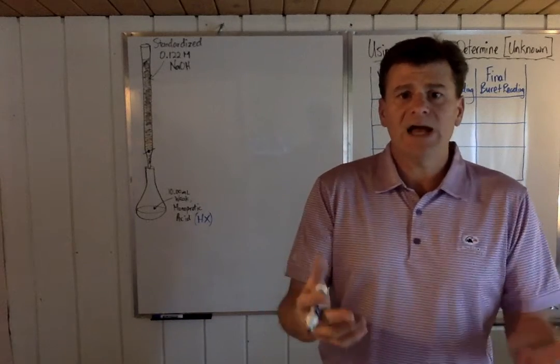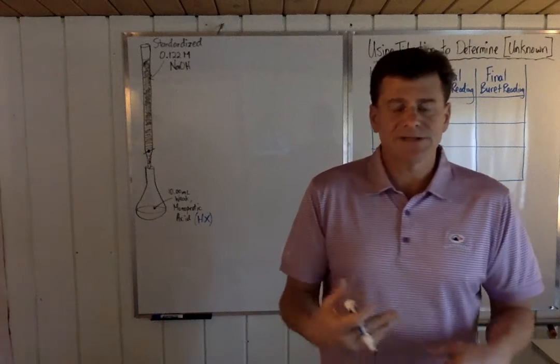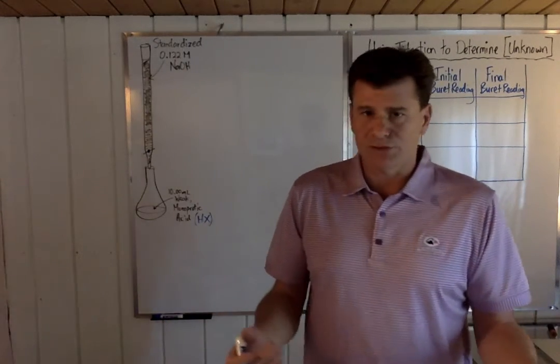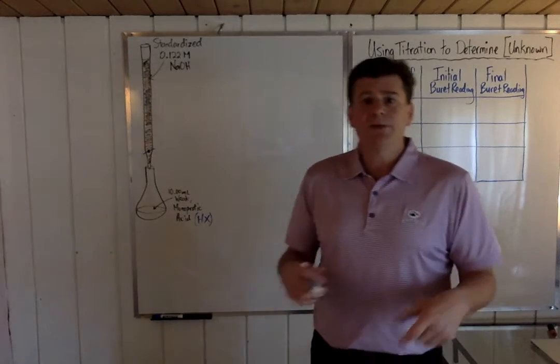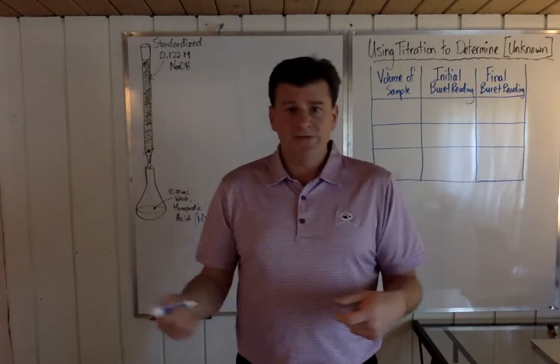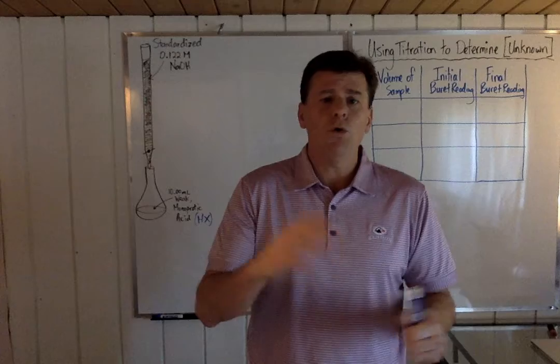Because it's an acid whose concentration I want to determine, what I would do is titrate using a strong base. The very typical strong base in our chemistry lab is sodium hydroxide. So what I've done is I've prepared the burette to deliver sodium hydroxide. Now, a whole bunch of things here.